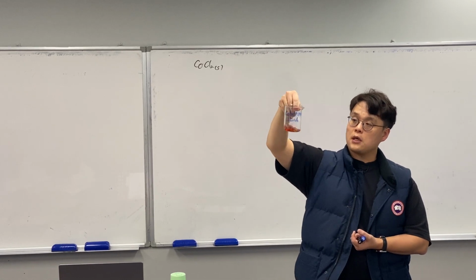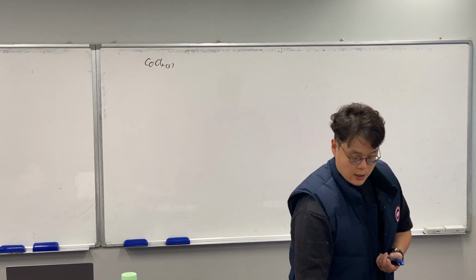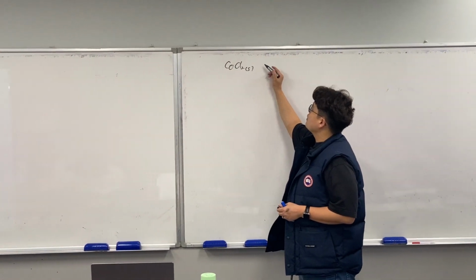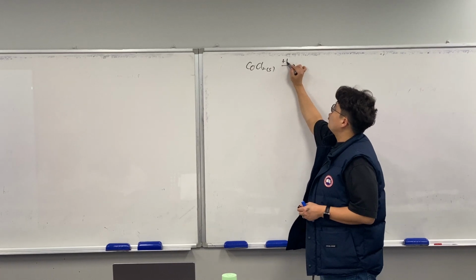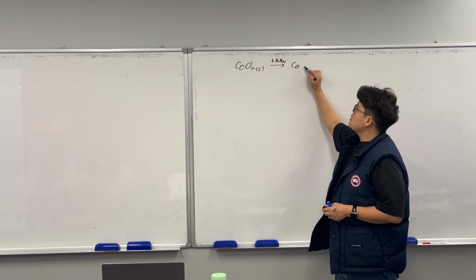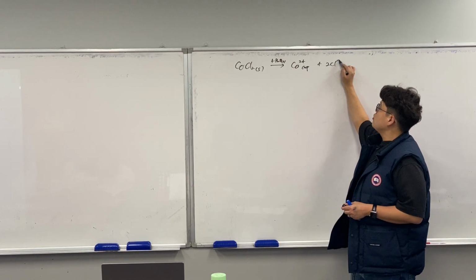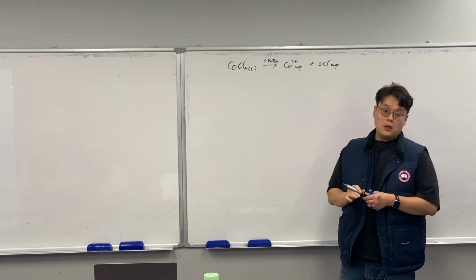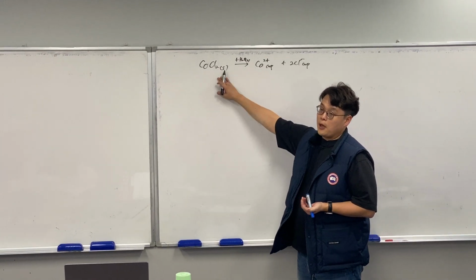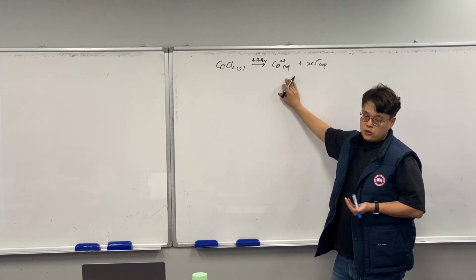Yep, it shows the kind of purplish, red colors, pink colors too. So, writing down as a form, the cobalt chloride is now divided into these. We added some water into it. Now becoming cobalt(II) 2+ aqueous, and leaving that 2 chloride aqueous form too. Yep, that's something we discussed about the dissociation of the ionic compound in the water. So let's have a think about what happened to the cobalt inside that too.